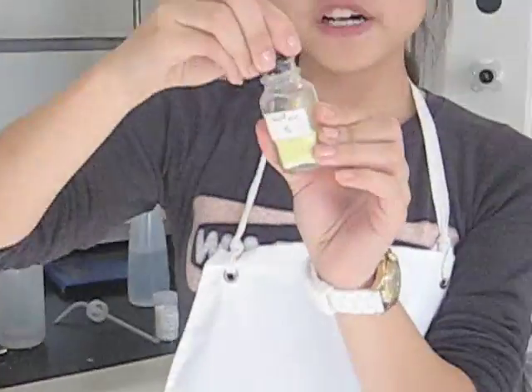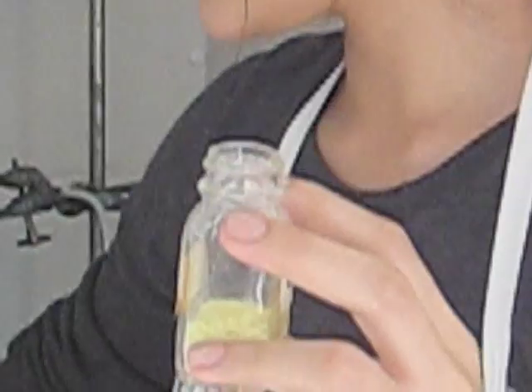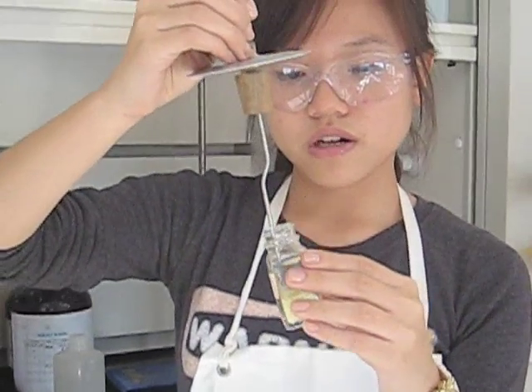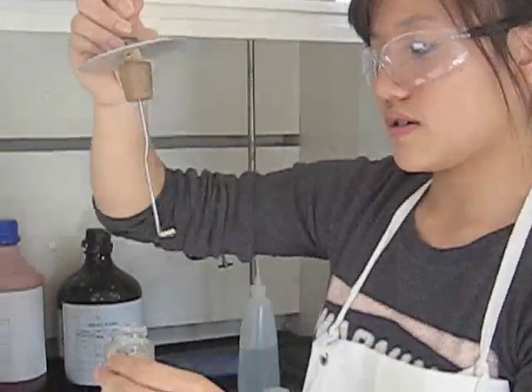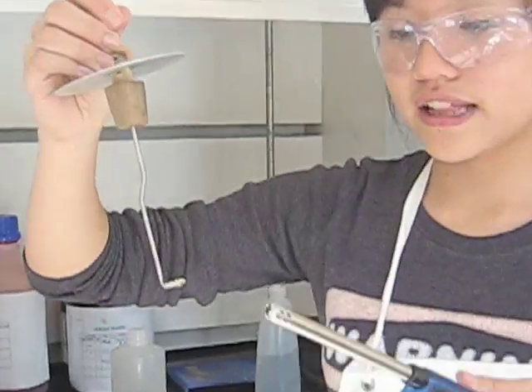So here's our sulfur. Sulfur is a yellow solid. And taking this tool, I'm going to take some sulfur and carefully light it up.